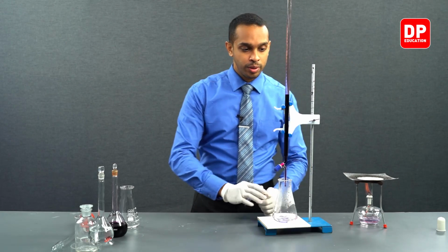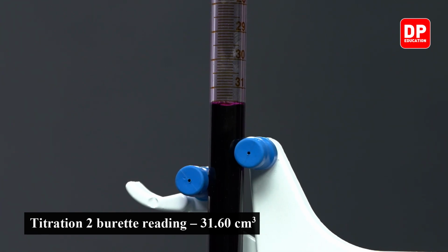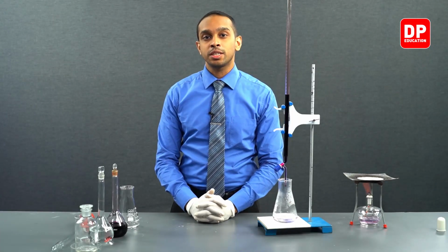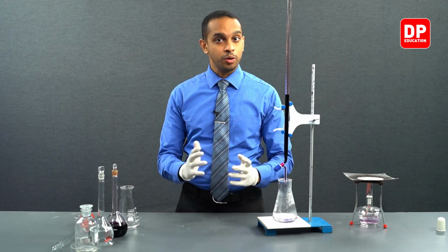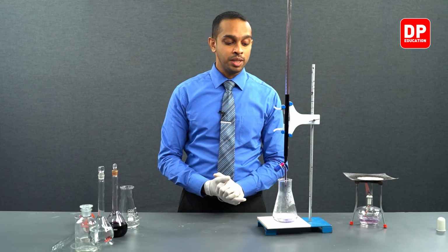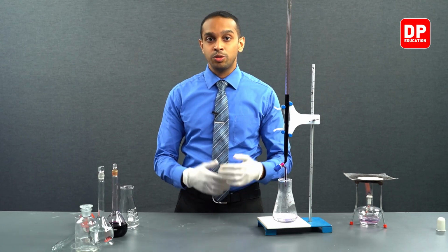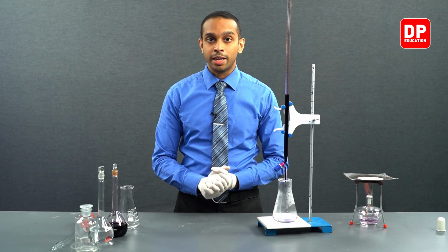So if you take a look at the burette reading now, it is exactly at the same reading as before, 31.6. So the reading of the second titration was also exactly 31.6. This is a good indication, giving us an idea that the titration reading has been precise. That means we have been following the right methods. Our measurements have been somewhat accurate.